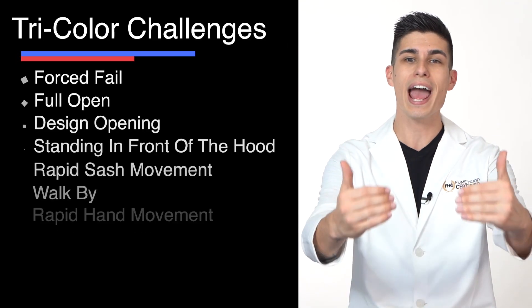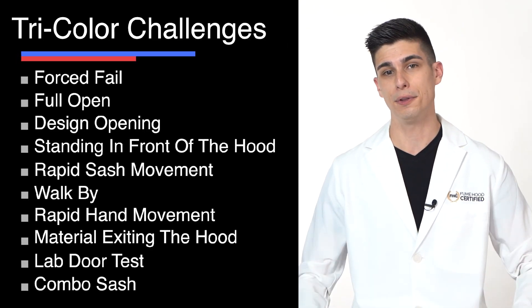In other words, we came up with different ways to pull smoke out of the fume hood by mocking what would happen in a real lab.